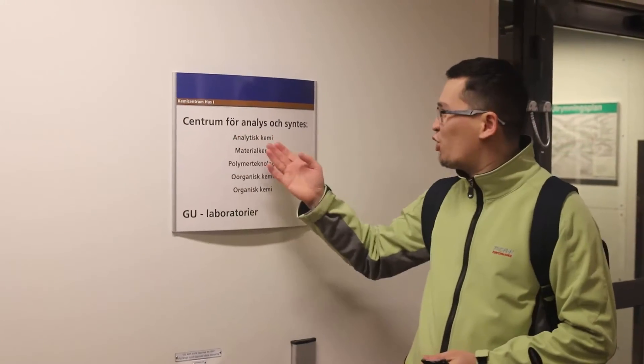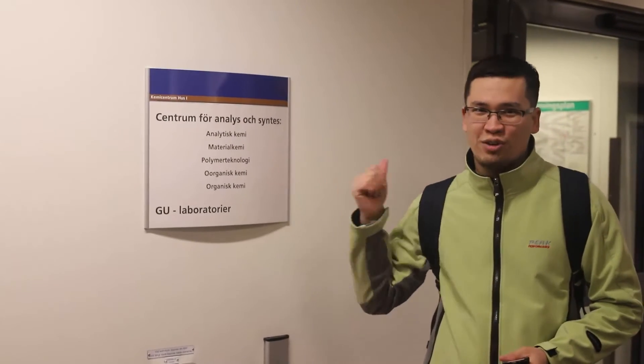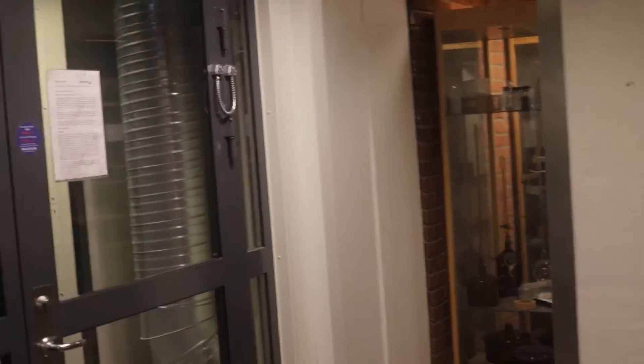Okay, so we reach to the CASS Center for Analysis and Synthesis. Let's enter the corridor.